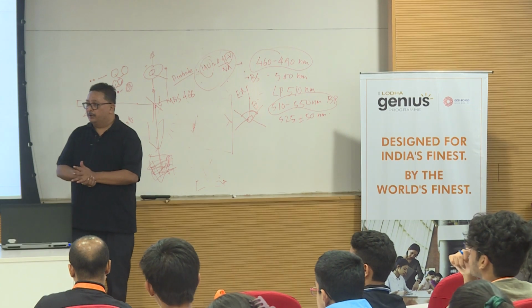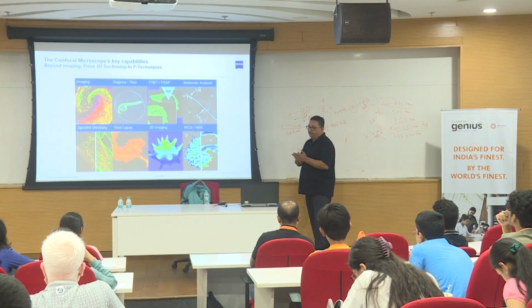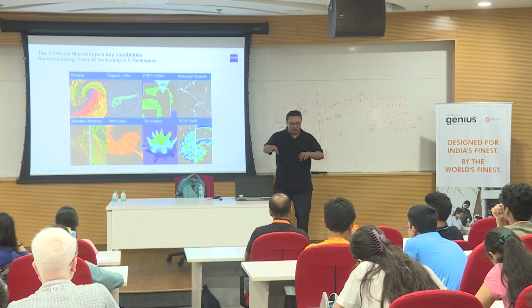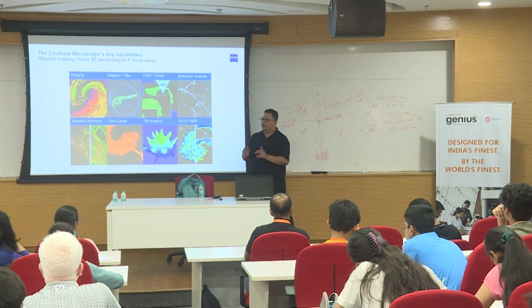First of all, what is quantification? Quantification of data means how the signal is behaving. Whether it is a weak signal or a strong signal, at two different locations, is there a change in the intensity of the signals? So that is what you call quantification.